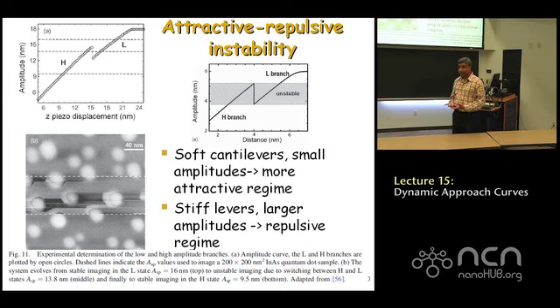So that's not a wise choice, because as you're scanning, your controller can get confused: 2 z distances with the same amplitude, right? You don't want that to happen. You want this amplitude versus z curve to be monotonic, right? Just one value for every z, but you don't get that. So here are images taken at L, at the topmost set point of 16 nanometers.